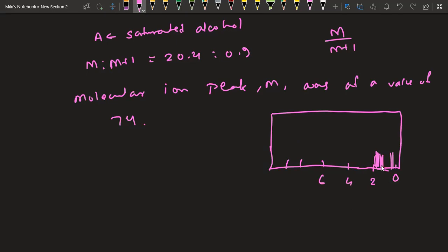So that means it's a multiplet. And more than 2, we have a singlet here. And near to 4, we have a doublet here. So these are clear, isn't it? We can clearly observe them, and we know that there is a multiplet over here.